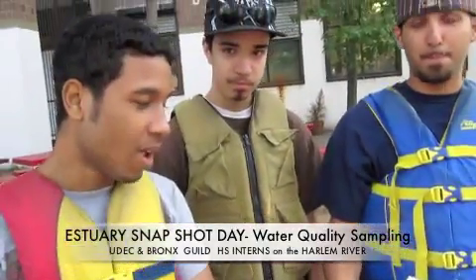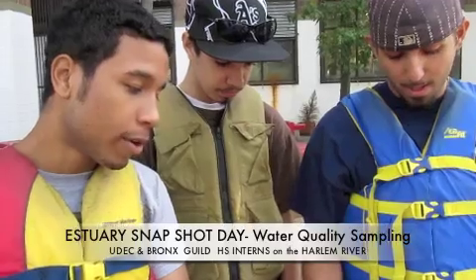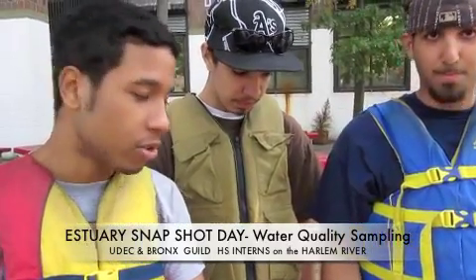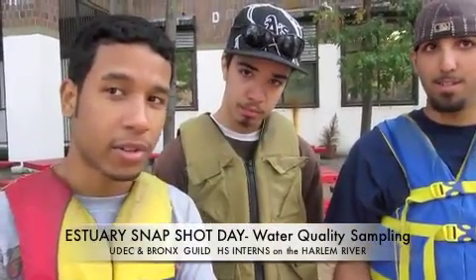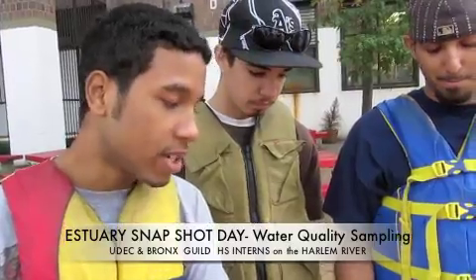So your conclusion is? That the water is neutral right now. And, well, it should be a little higher since I guess it's a little cooler than natural. But I don't know. It seems like it's normal.